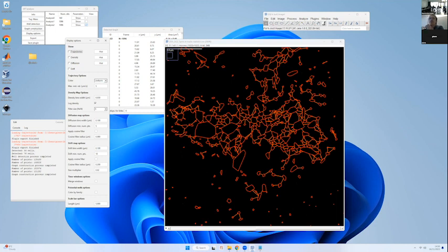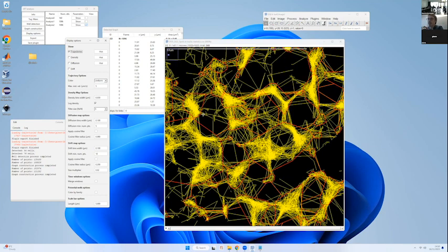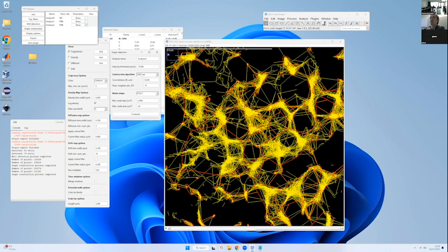Yeah, that's just another option. You see, for example, dbScan is great, but it's not super well adapted to SPT, because if you have regions that have different densities, it's not going to work well. It's going to create big nodes because dbScan wants a uniform density. So we have a way around that in another algorithm we developed, which is dbScan recursive.